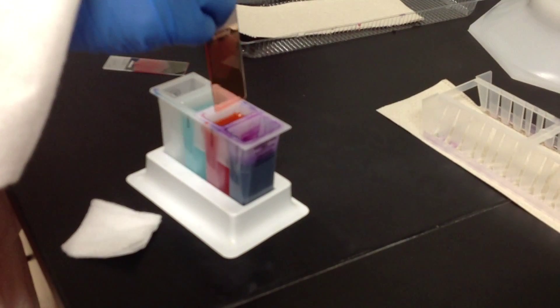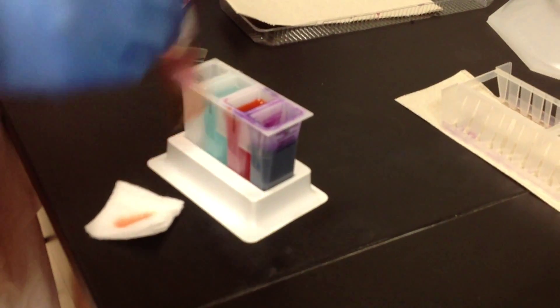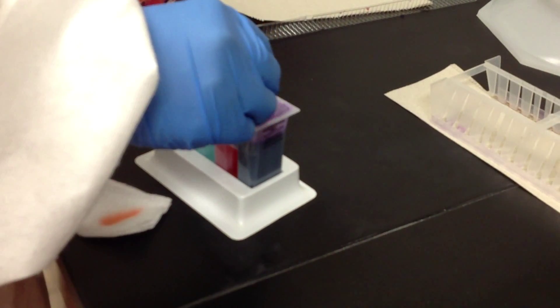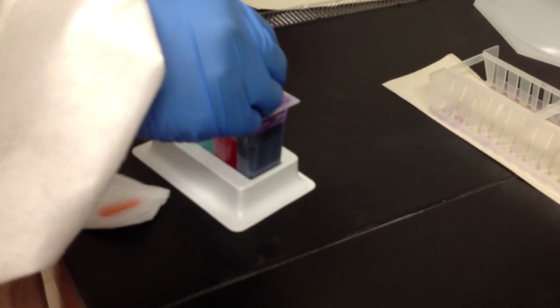After the fifth dip, blot gently on the end only, and then go to the second stain. The same thing: five one-second dips. And then immediately over to the running water.